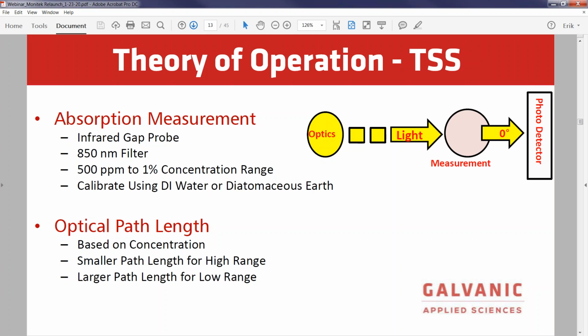And this would be used where a customer is saying, hey, we want to do anything from 300, 400, 500 ppm and up. Well, when we get to that level, with our forward scatter, our dual channel system, because of the optics and the geometry and the apertures, we really reduce the lamp signal. But also at that range, the sample itself absorbs too much. So a forward scatter ratio measurement doesn't really work. It's not a great success story if we go that route.